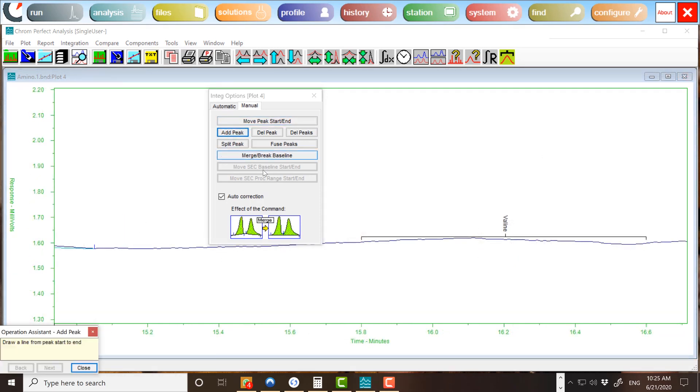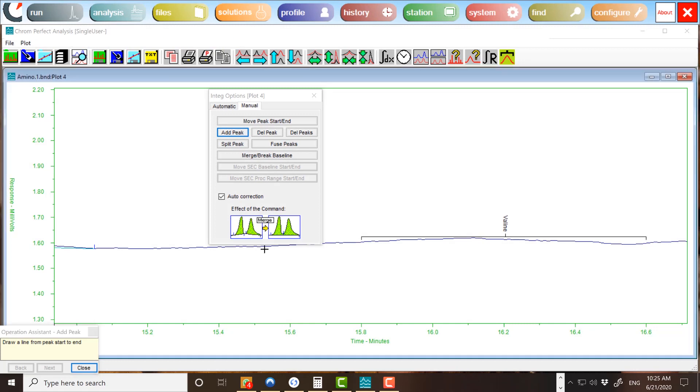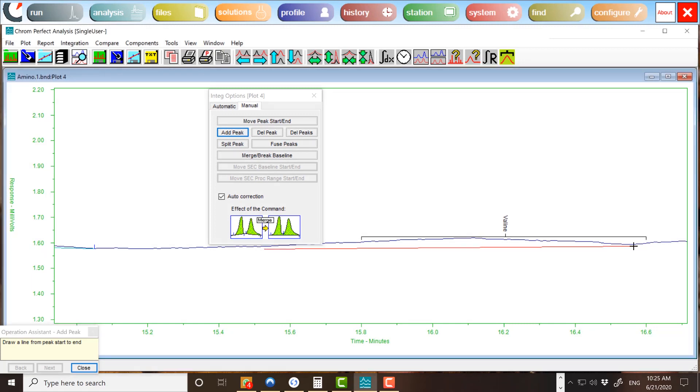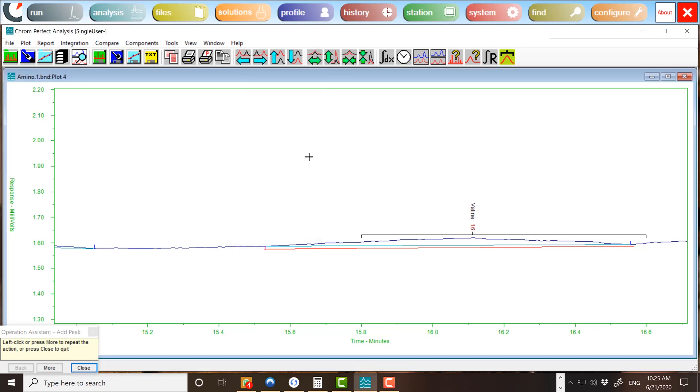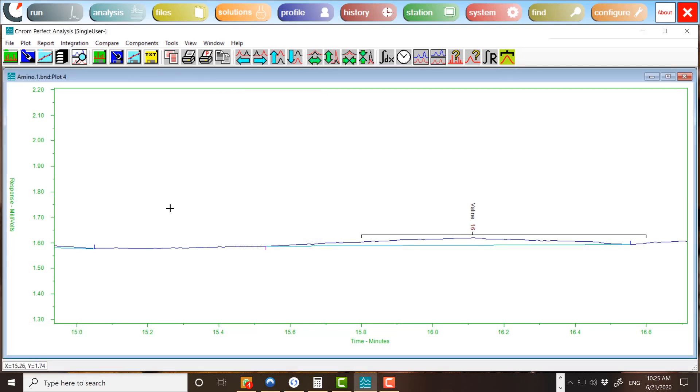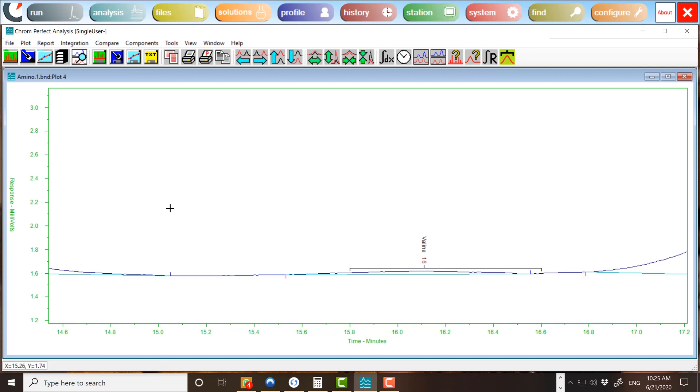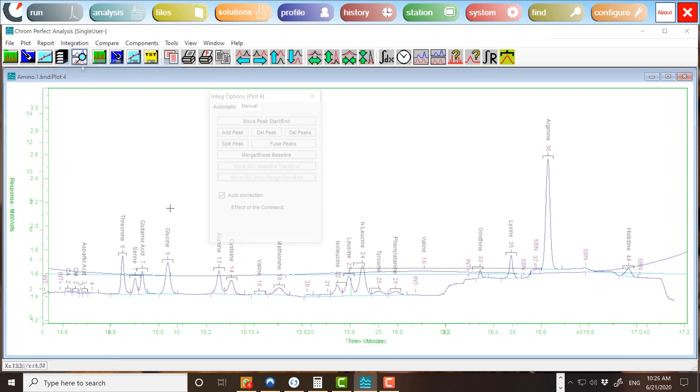To add a new peak, press the Add Peak button. The Operation Assistant will appear, directing you to draw the baseline with the mouse. Left-click on the chromatogram plot where the baseline should start. Drag in either direction and a red rubber baseline will appear and will pivot around the initial point. When this baseline is in the desired position, release the mouse and right-click on the chromatogram plot. The chromatogram will be reintegrated and the new peak will appear with its baseline.